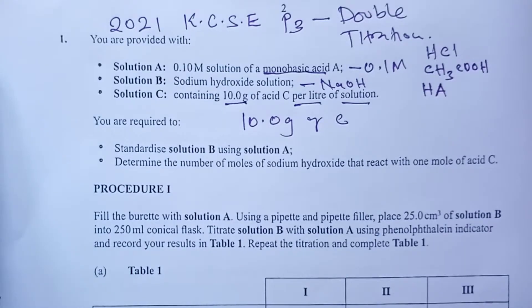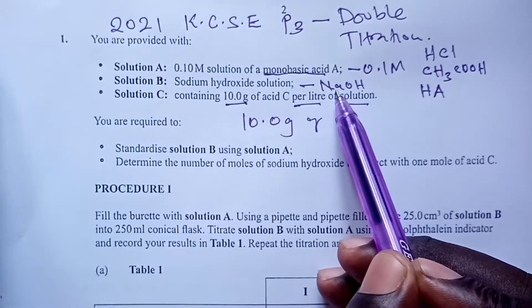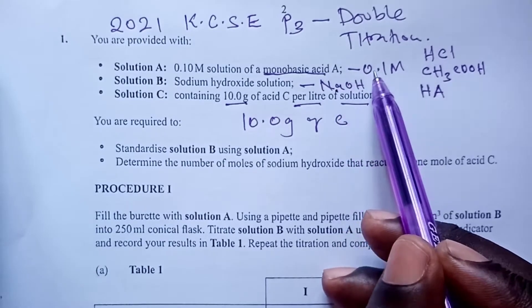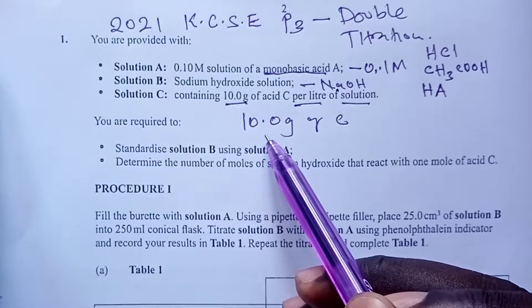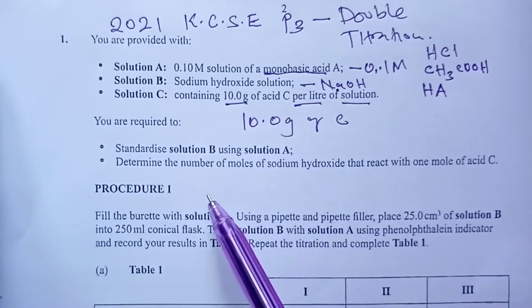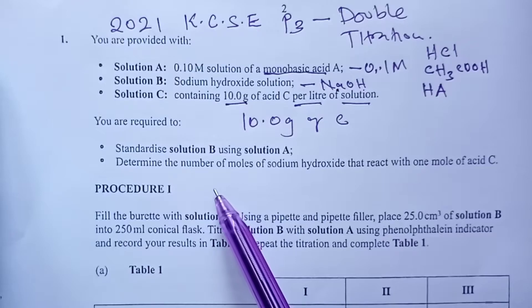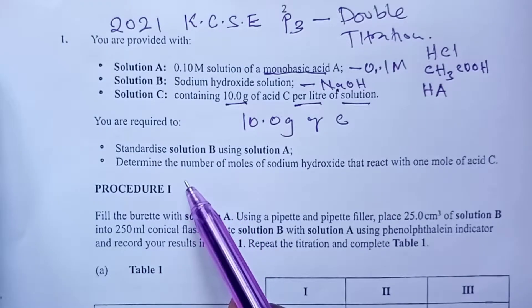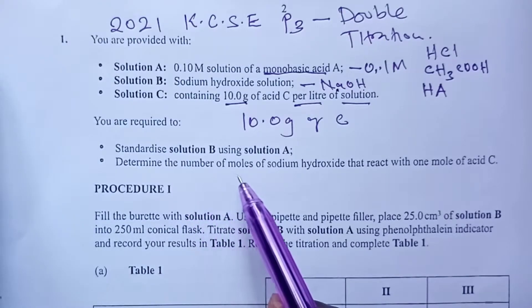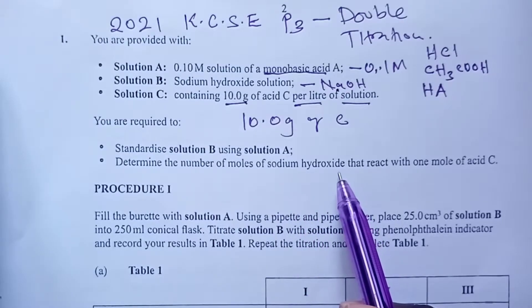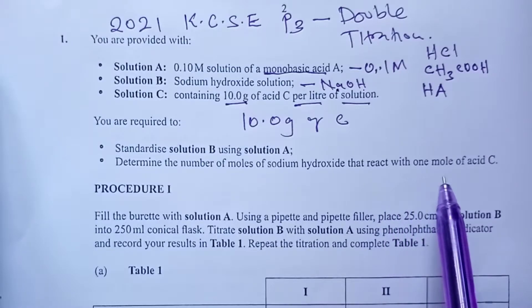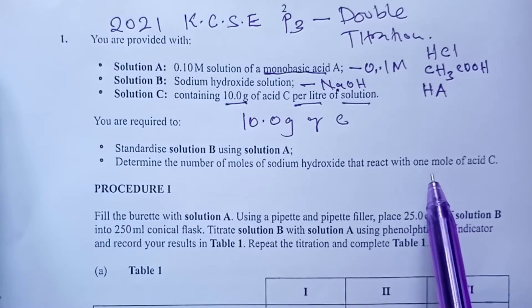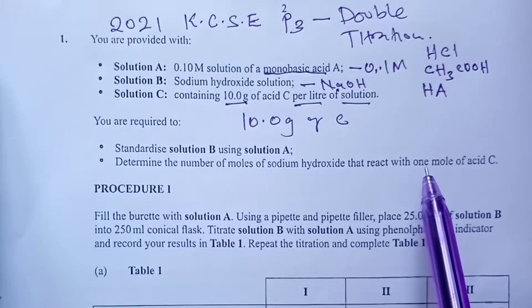So let us move on to what you are required to do in the practical. So number one, we want to standardize solution B, this sodium hydroxide, using A. And standardization simply means we want to find its concentration. And then two, we were tasked to determine the number of moles of sodium hydroxide solution after standardization that would react with one mole of acid C. Now, to the procedure.